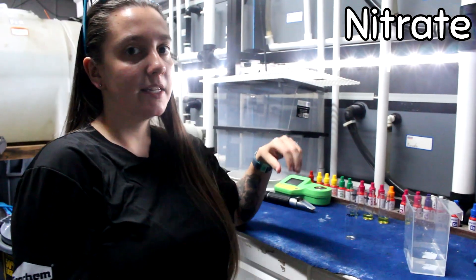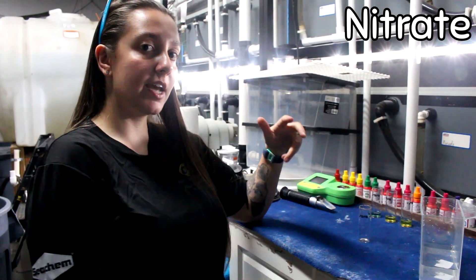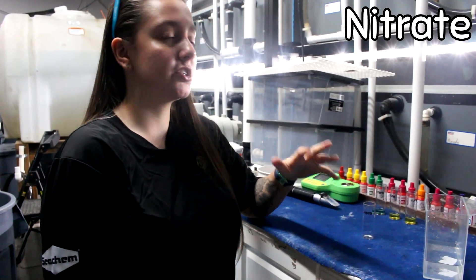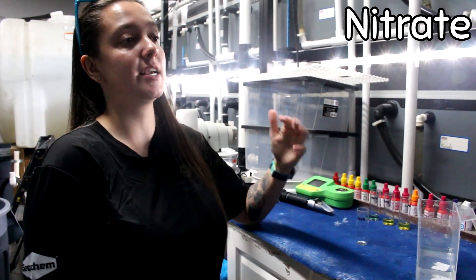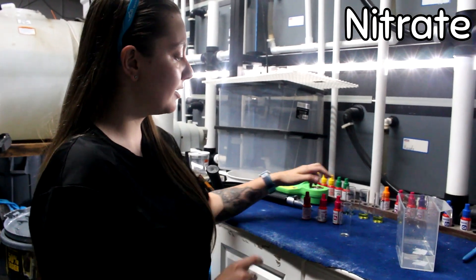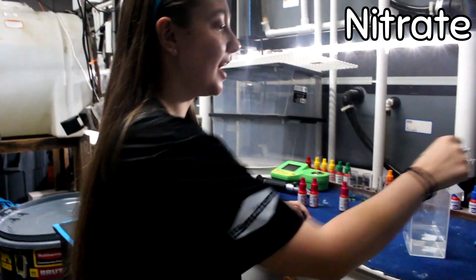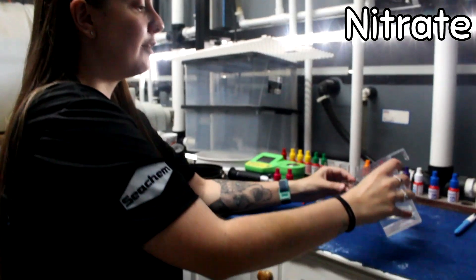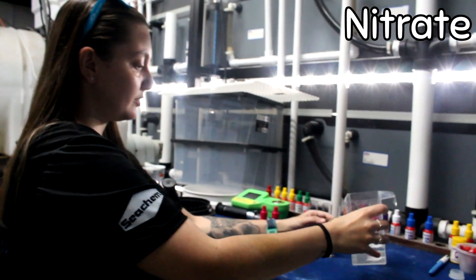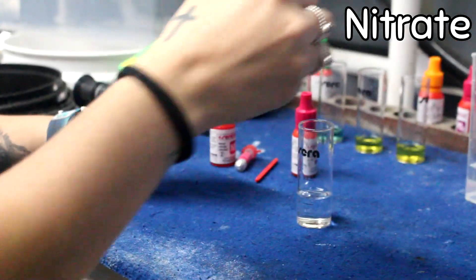Last but not least, we're going to test nitrates. Nitrates are actually the good bacteria you want in your tank, but we do want to make sure it's not super high because in high doses it can be toxic for your fish. This one's actually a four-part test — you have three bottles labeled one, two, and four. Your third step is actually going to be a little powder with the number three on it. For both fresh and salt water you're going to use 10 milliliters of water, and for each bottle during the nitrate step you're going to use six drops of each.